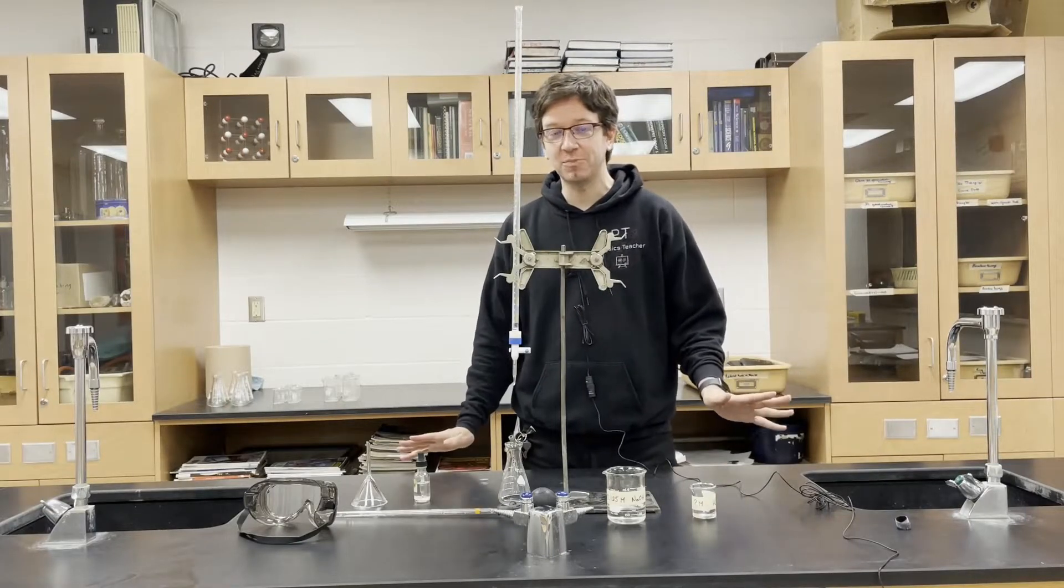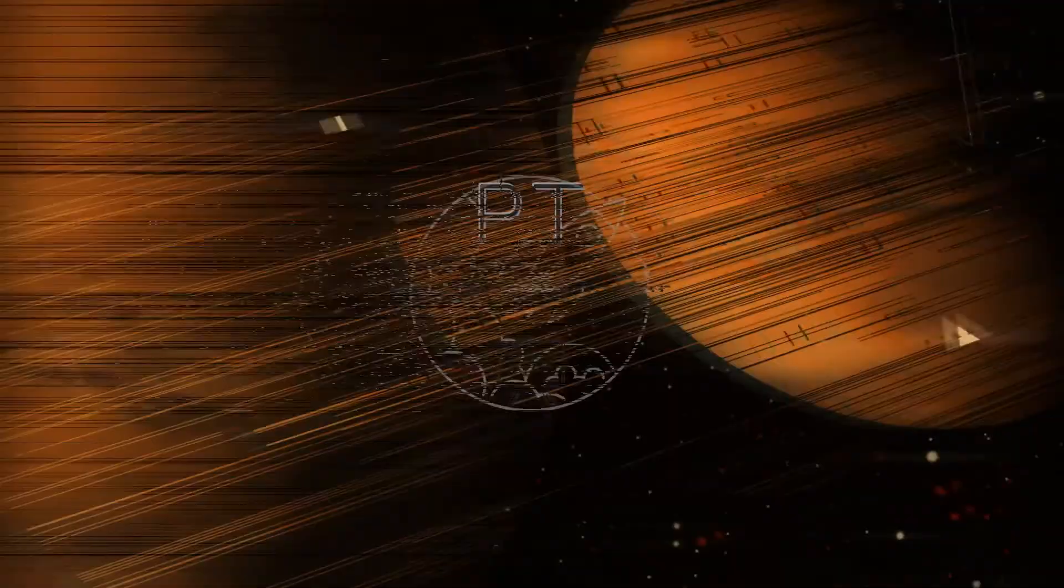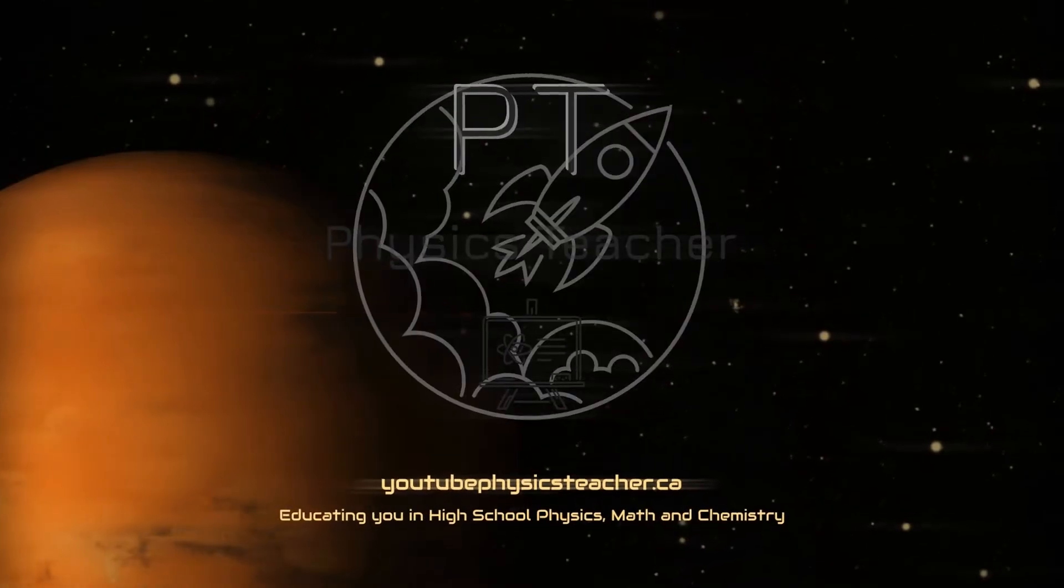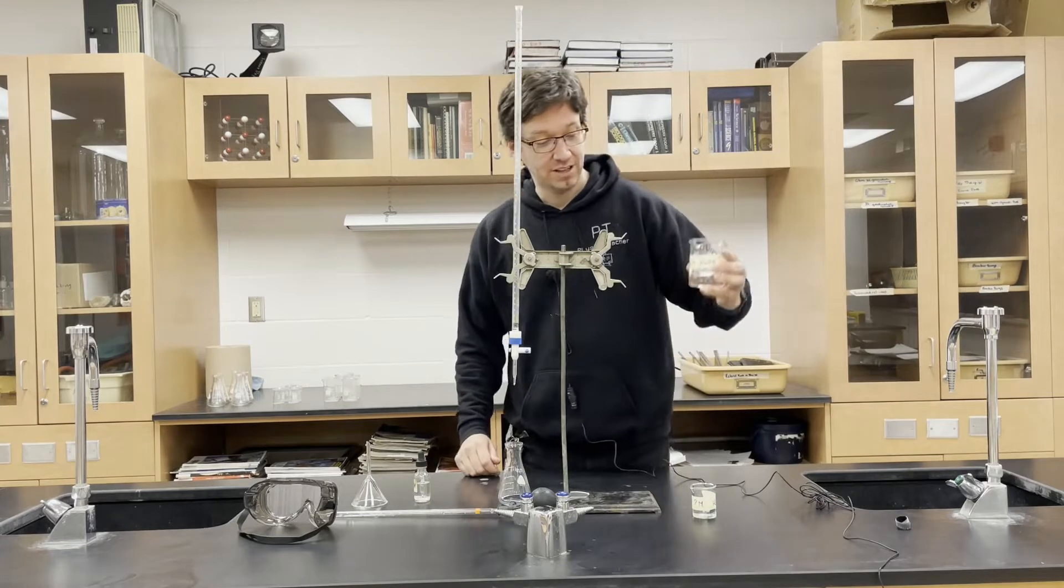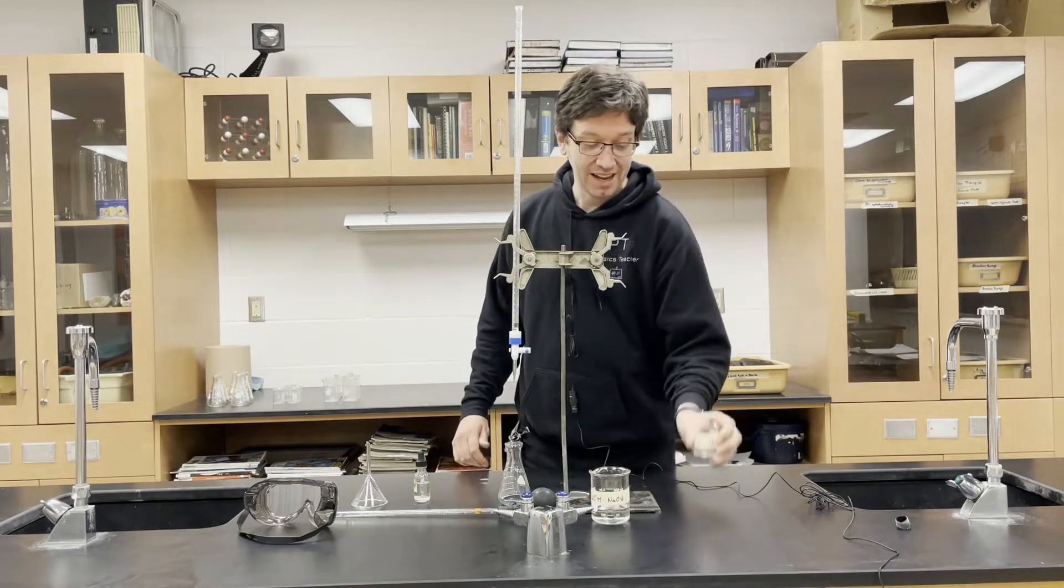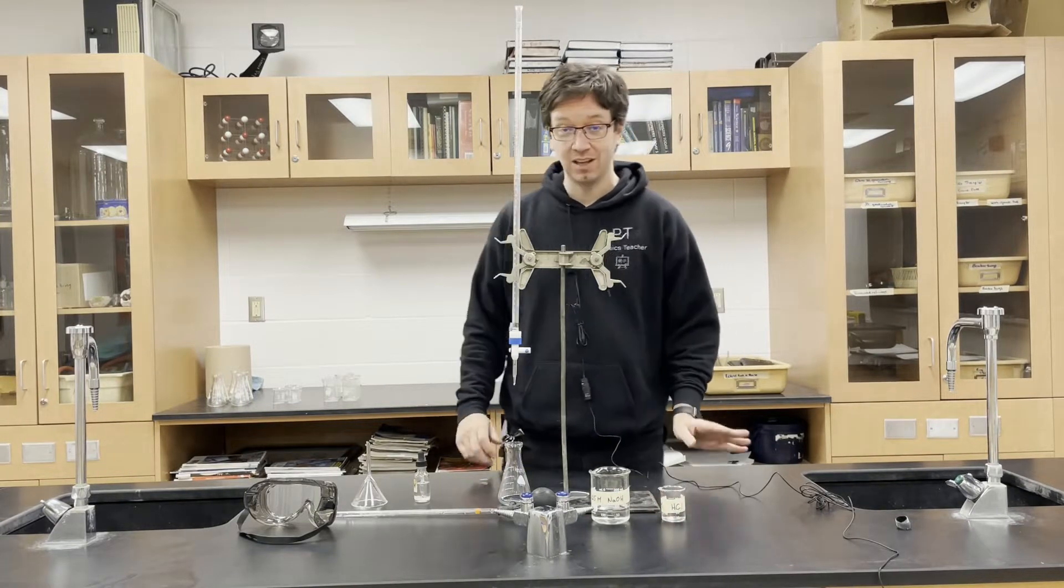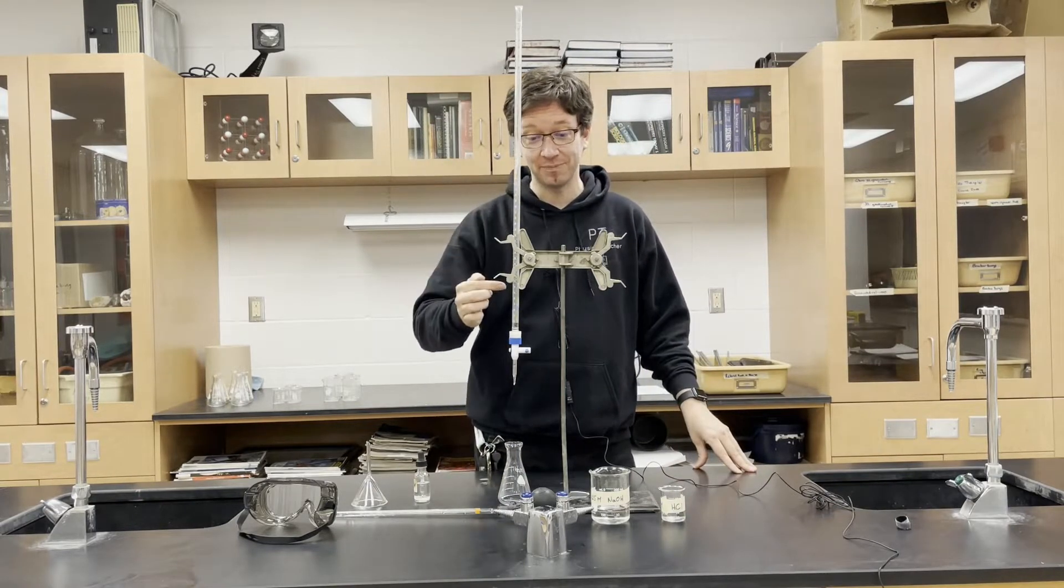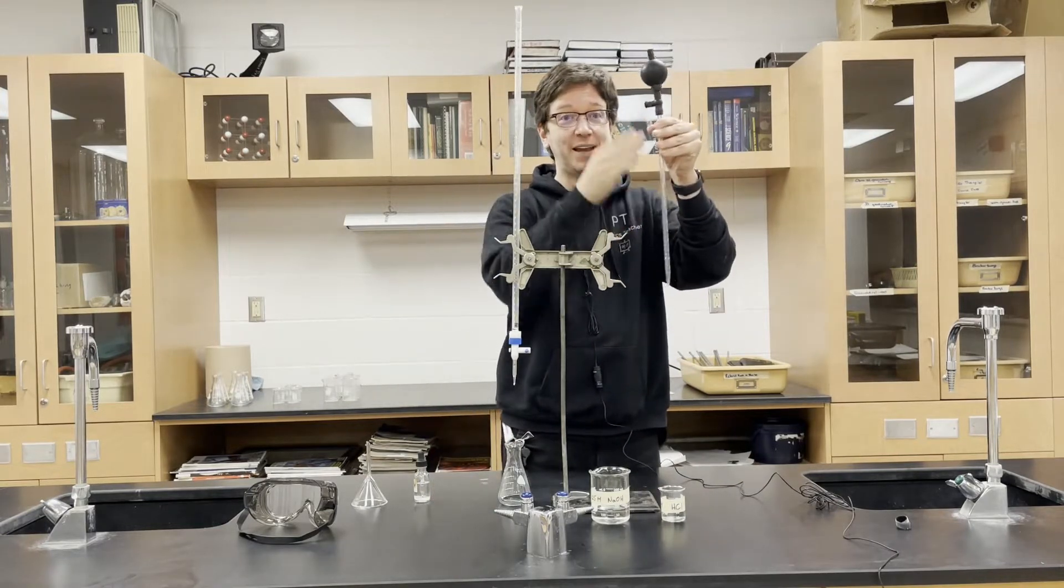In this chemistry experiment I'm going to show you how to do a titration. Here I have 0.125 molar sodium hydroxide and here I have hydrochloric acid with an unknown molarity. Some of the new equipment we're using is this burette, this burette clamp, and here we have a pipette and bulb.